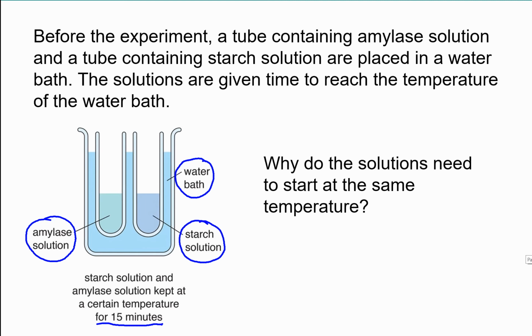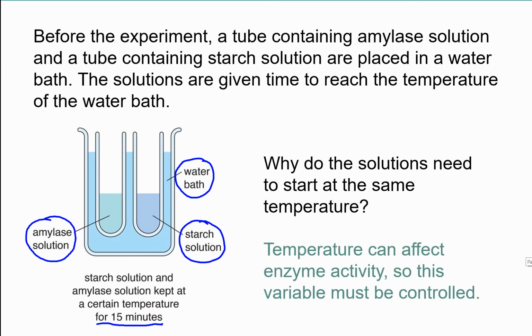So why do the solutions need to start at the same temperature? That is an important question. Because temperature can affect the enzyme activity. So this variable must be controlled during the experiment.